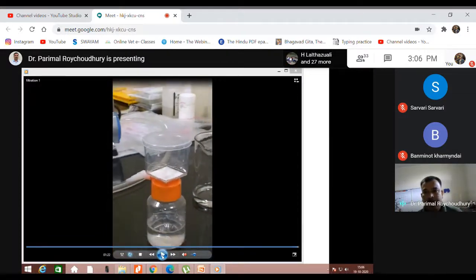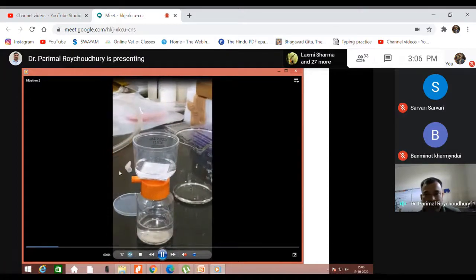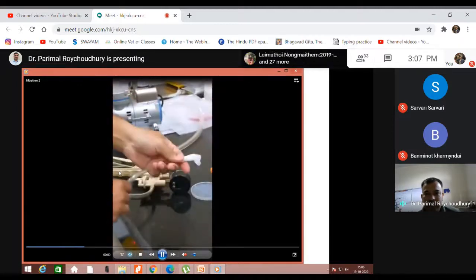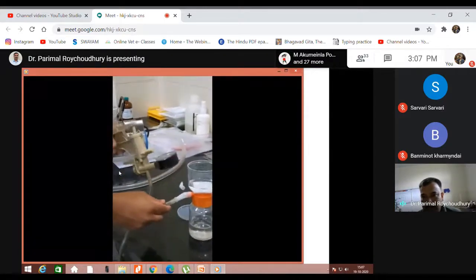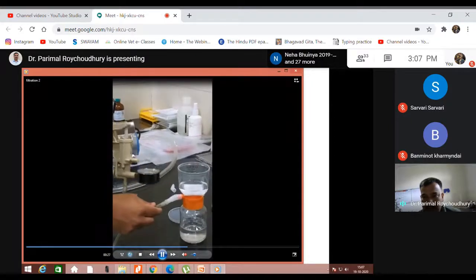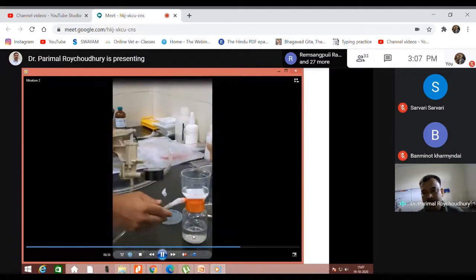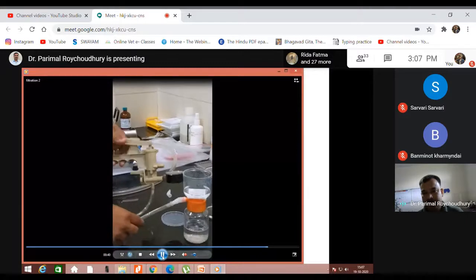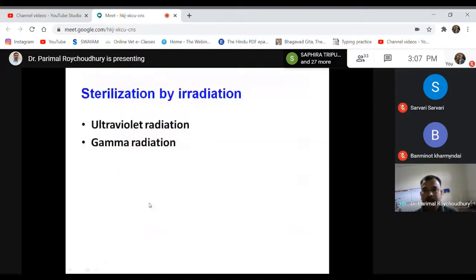Now, sometimes on some occasions, this kind of suction pump may not be available to you. So in that case, we have another device, a hand suction pump. This is a hand suction pump. It can also be used, but it is not as effective as the suction pump. We can just go on plunging it, and the air will pass out of this chamber, and gradually you can see the filtration rate is very slow. But if you don't have any suction pump or there is no current, then we can go for this kind of hand suction pump for filtration purposes.